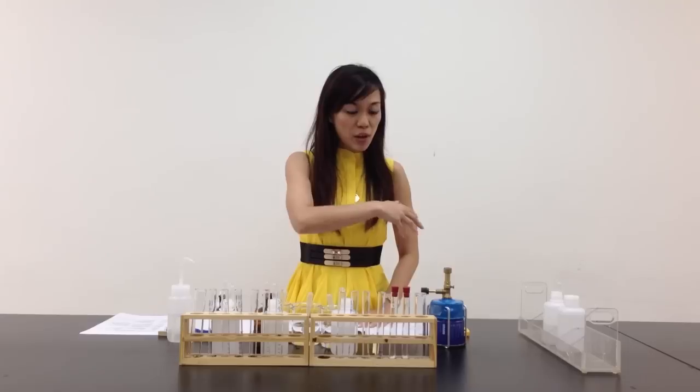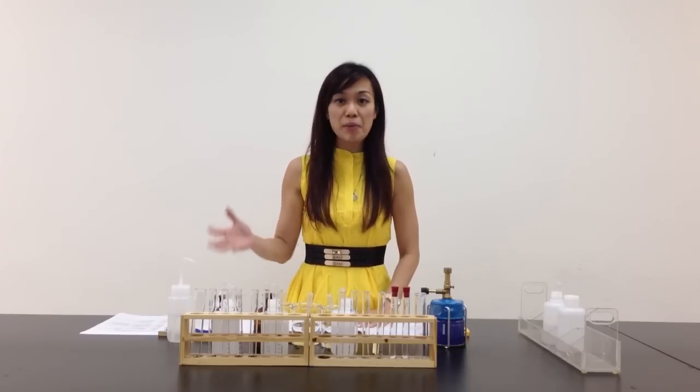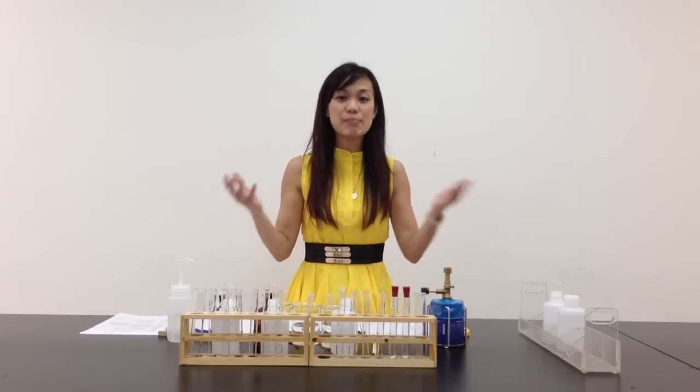Now you can see over here that the whole table is set up, so we are very well prepared. Are you ready? Let's begin the experiment.